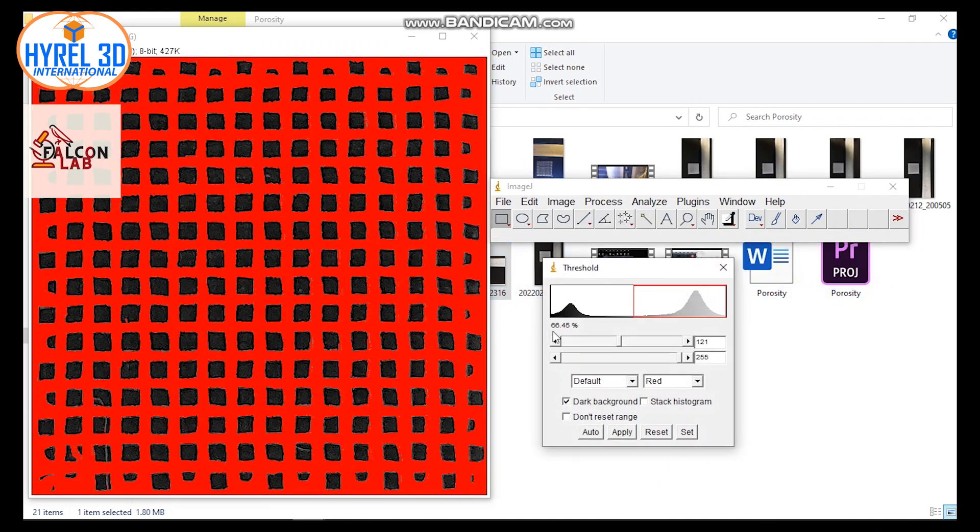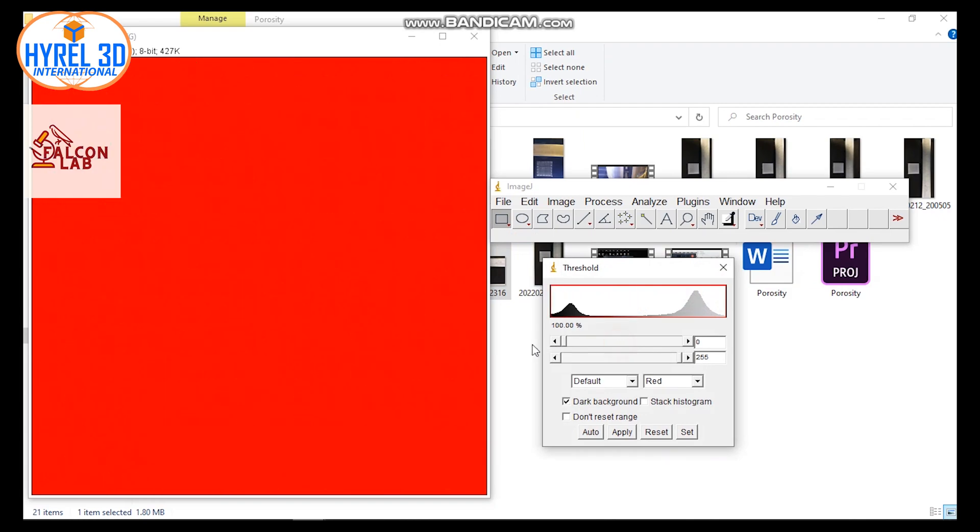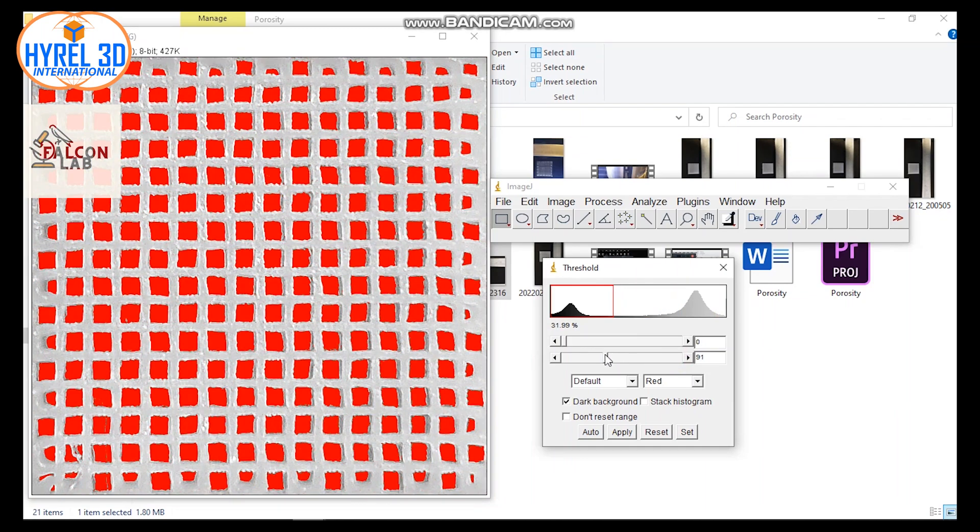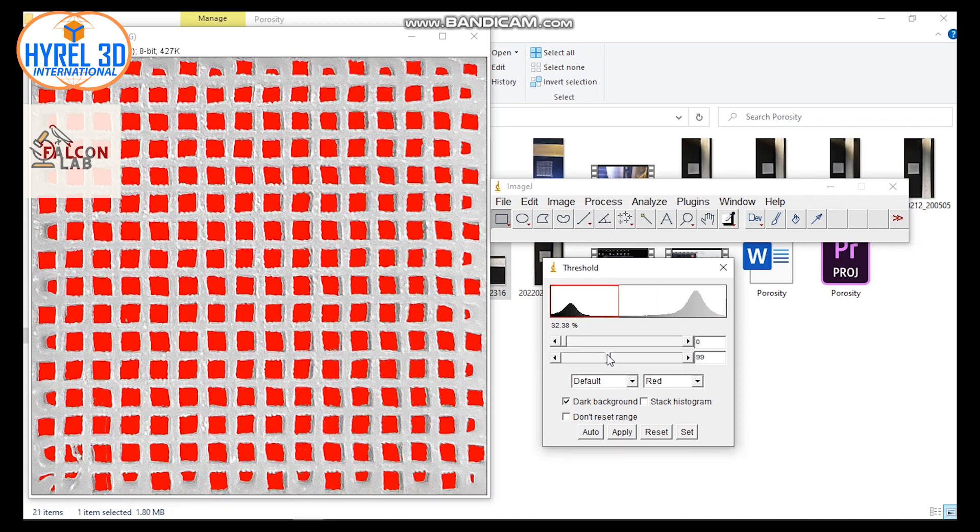The red color indicates the area that will be calculated, so let's flip it and focus on the pores. Keep playing with the threshold bar until you can't see any red dots in the edges of the strings.